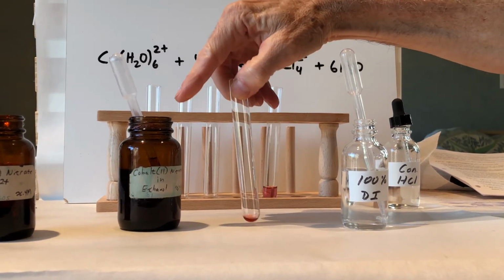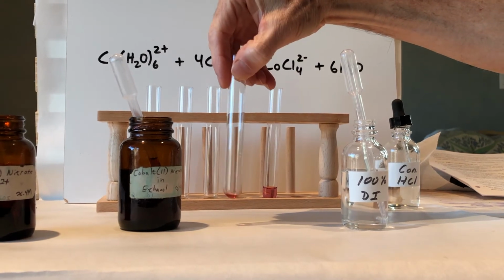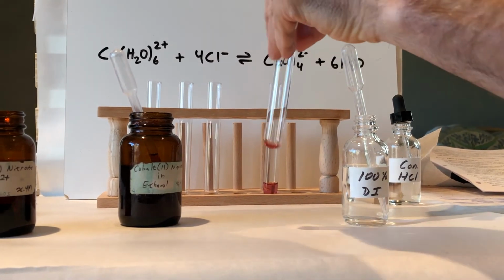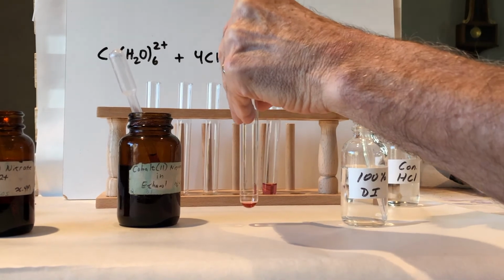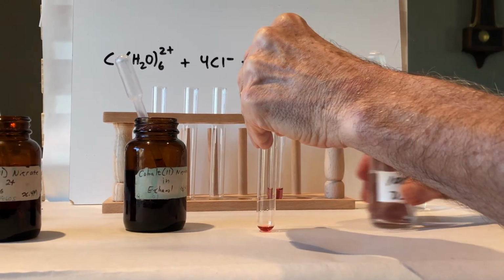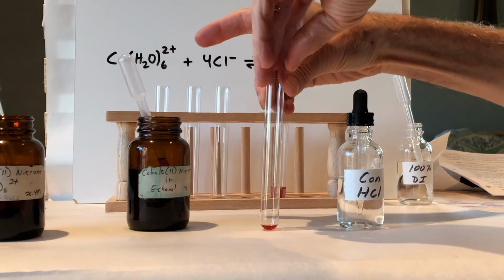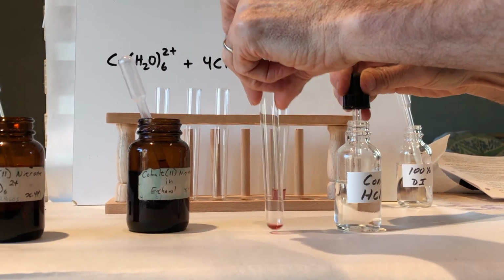Just as a note, this was made by taking cobalt nitrate solution, which actually is hydrated, has a little bit of water in it, and then we dissolved that in ethanol. So you can see the color of the ion, and now to that we're going to do the same thing as we did before. We're going to add some concentrated HCl, which is a source of Cl- ion, and you might predict what will happen.